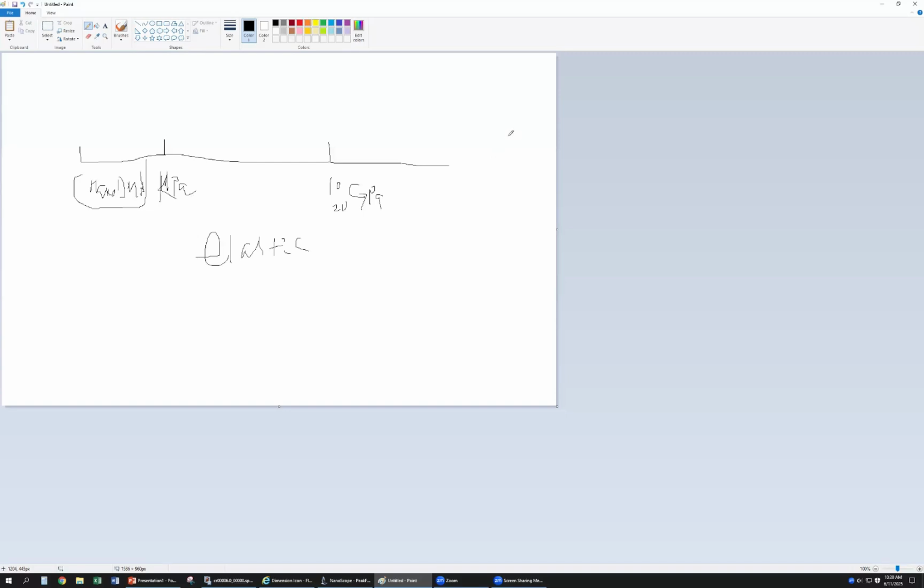So that's the problem. If your sample is over 20 GPa, we should use contact resonance. So that means we cannot get the indentation. So that's the QNM suitable range.